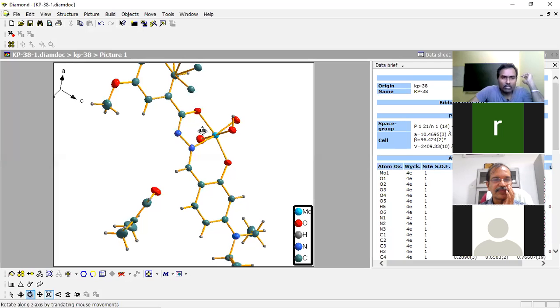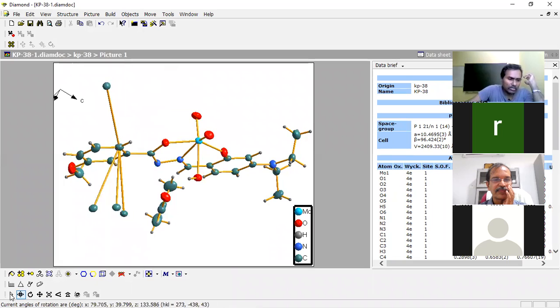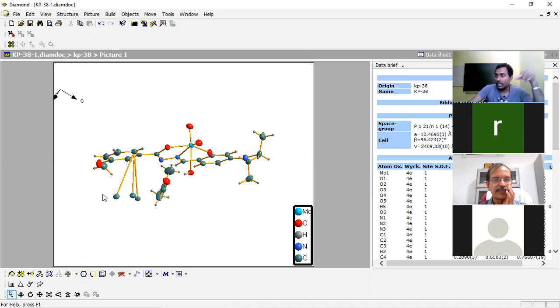So now we can rotate and see that on the other side also one atom is left without deleting. So we can delete it because we have found the atoms within the sphere. Then now what we have to do is delete the bonds between them, because we don't want those bonds. But we need to find out that whole molecule. Now the residue is found. So now we have to find out the whole molecule of that residue.